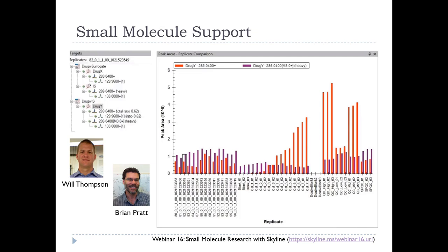Skyline has recently expanded into small molecule research. I guess we're not going to talk about that much here, but there's a whole webinar on it, and that's becoming really interesting. How many people do anything with small molecules? Okay, so yeah, you can now use Skyline for that too.